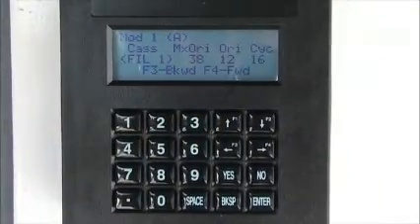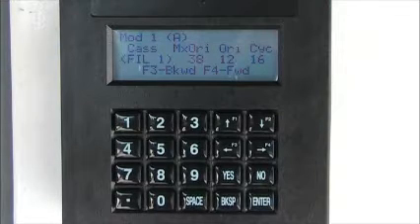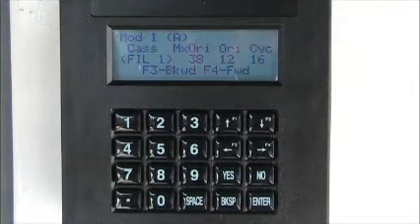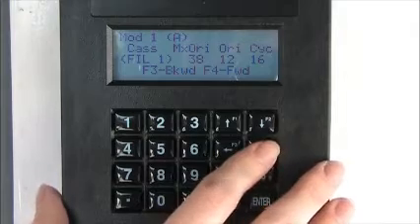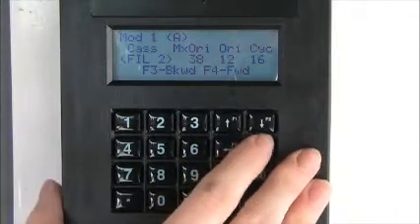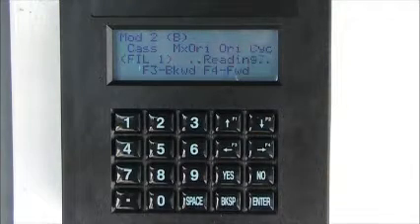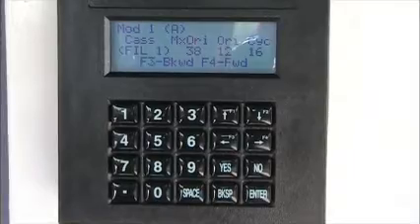Cycle through the readings for all modules by pressing F4 and record all the values. There will be 2 positions for each module in this week. Make sure that all the values are within the range listed on the sample log sheet.